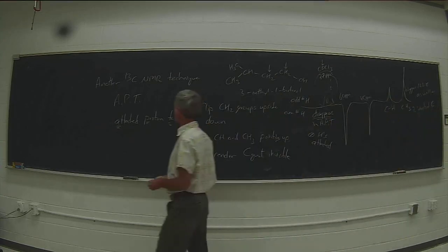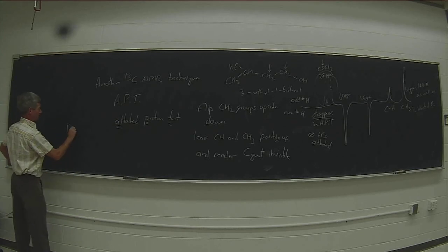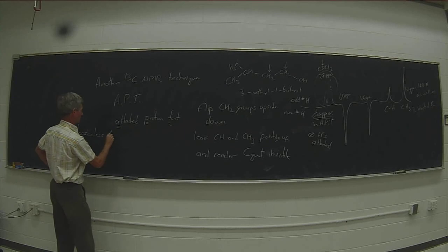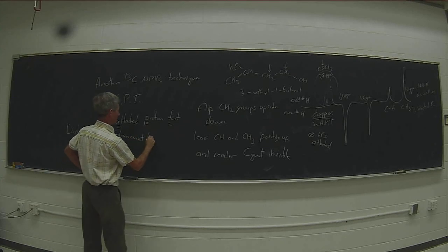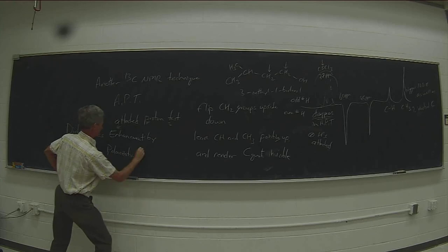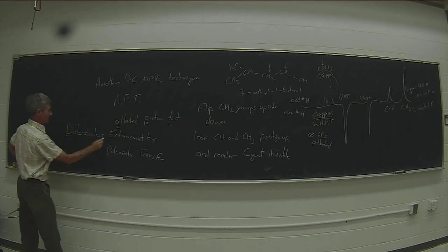There's a slightly more sophisticated technique called distortionless enhancement by polarization transfer, or DEPT.